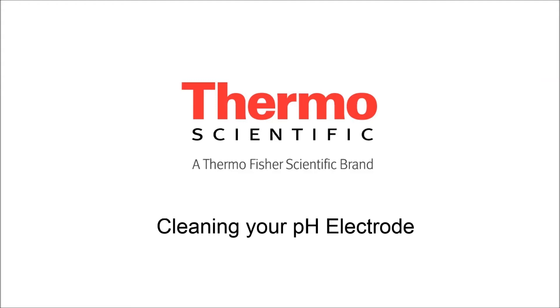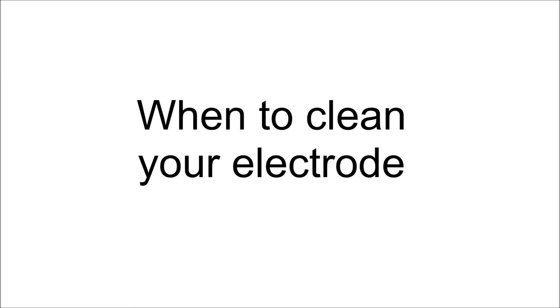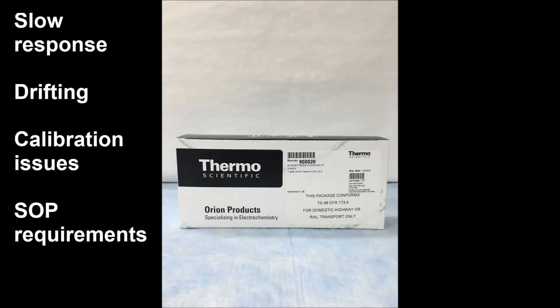Today we are going to discuss cleaning your pH electrode. First, we're going to start by determining when you should clean your electrode. You want to clean your electrode when you notice that it's slower than normal, it's drifting, with different calibration issues such as a bad slope, or it's taking a long time, or if your SOP requires it.